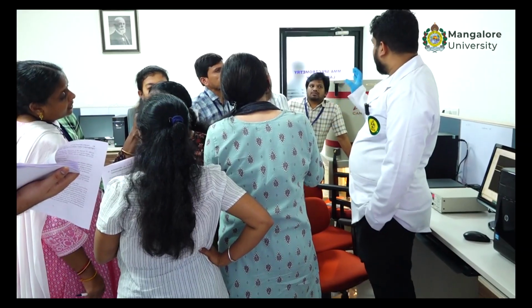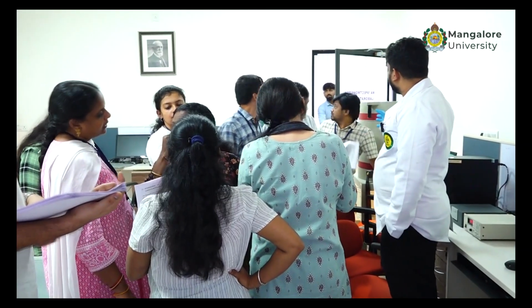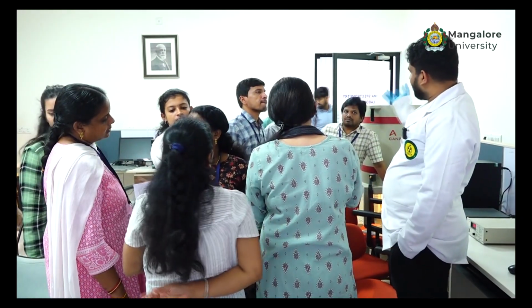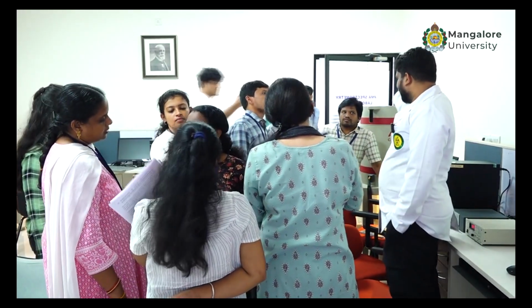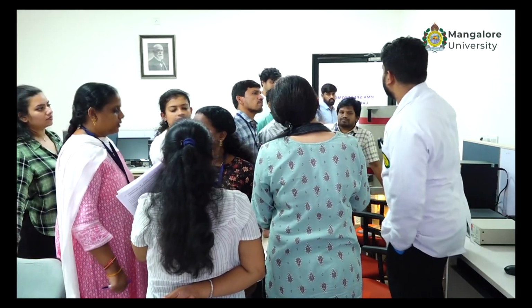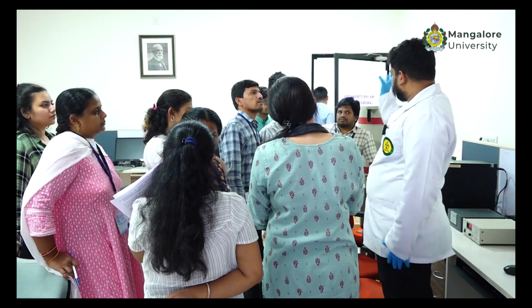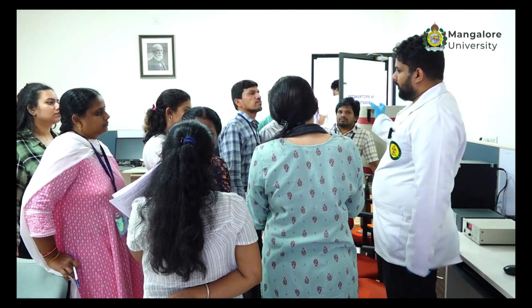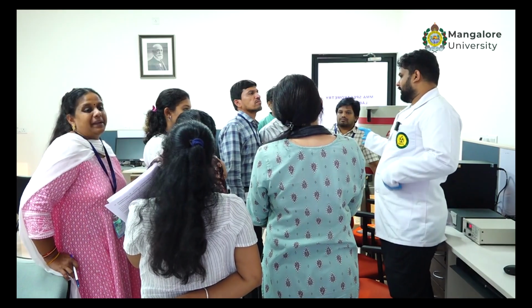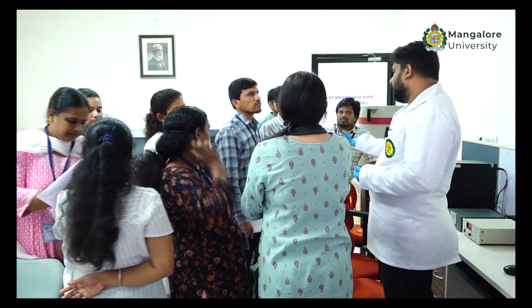When we say that MDA is so much, it is for so many seconds and this much weight. That information should be clearly mentioned. That is why we should take the sample count and background count at the same time.